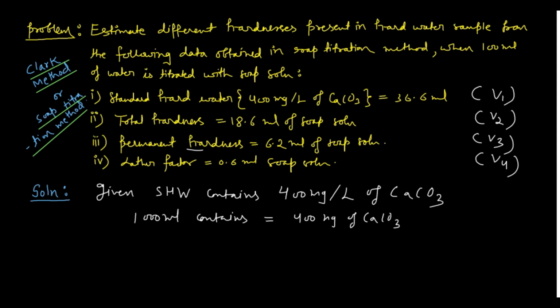What you have done, you have shifted this 1 liter here, that is 1000 ml, which contains 400 milligram, right? And you have to calculate for 100 ml.